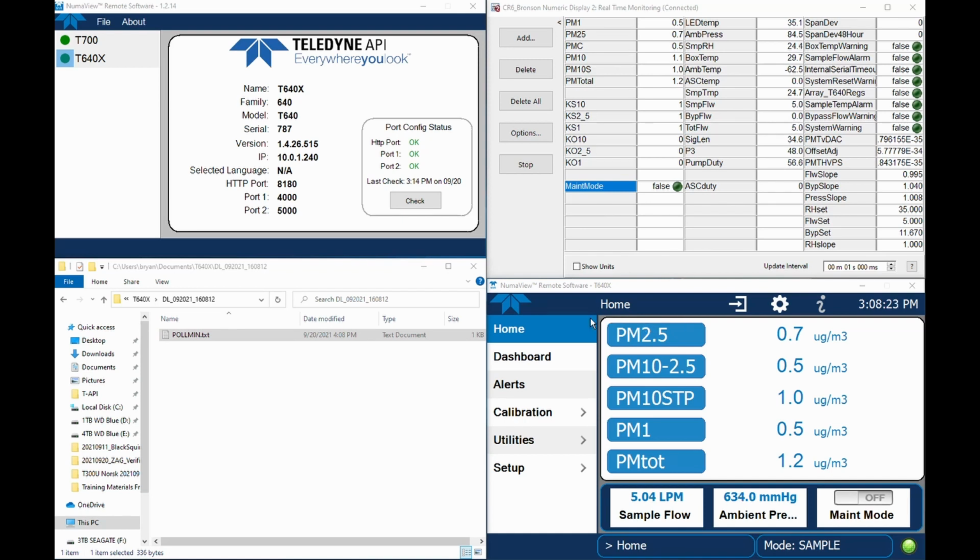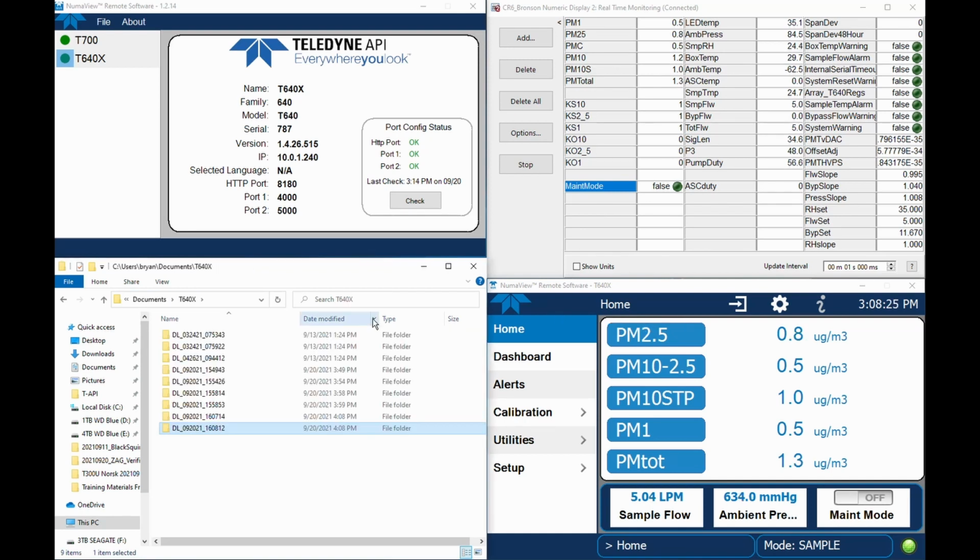Alright, so it's been a couple of minutes here. We've collected some data. You can see the pump is now running. If we look up here at our Modbus data, we've got some temperatures coming in here. We've got flows. We've got meaningful data here for this test now. It's showing up here. So let's go ahead and download that data log and take a look at what's in there. So if we go in, we pick this, we'll download that DAS.